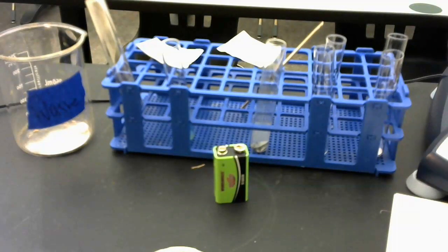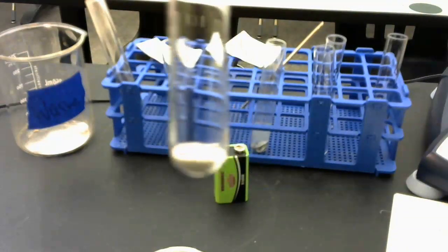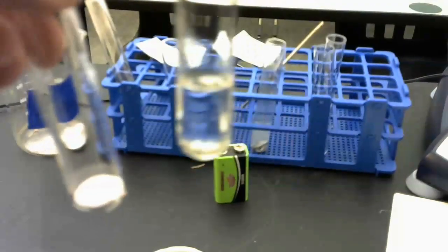Now, station number 8 on your lab, or reaction type D, number 2, is place a small scoop of solid sodium carbonate in a test tube to a depth of about 1 centimeter. Add a pipette of 3 molar hydrochloric acid. So I have my solid sodium carbonate right here. It's labeled for you Na2CO3. And I'm going to add my 3 molar hydrochloric acid.